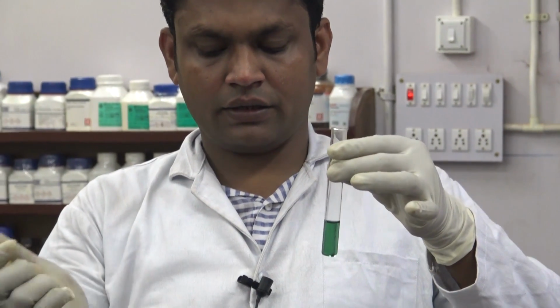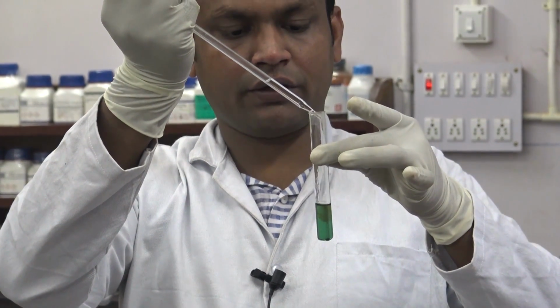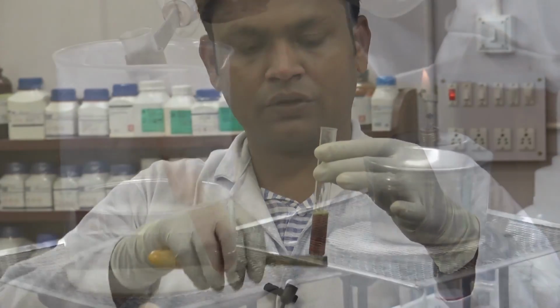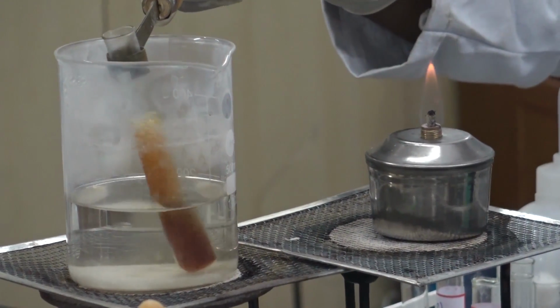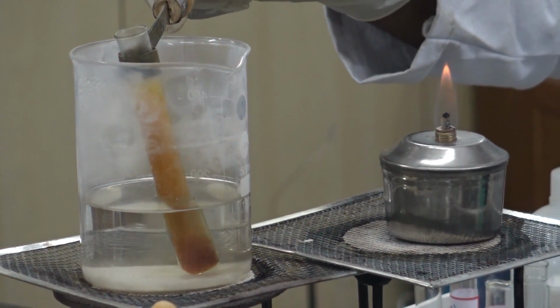Then add few drops of H2O2 solution. Heat the mixture until bubbling occurs.